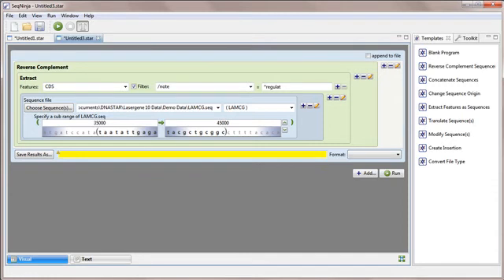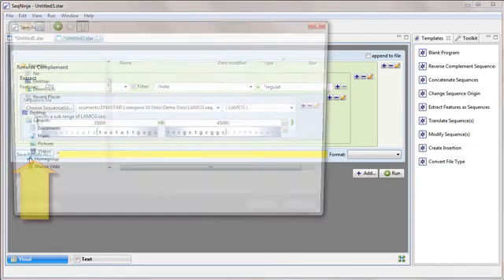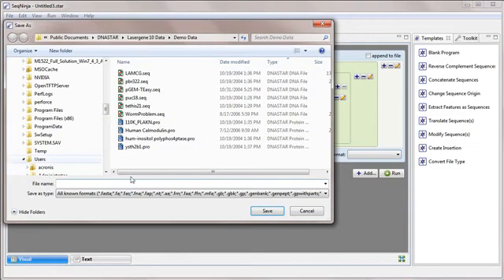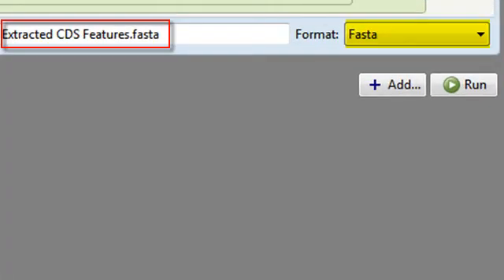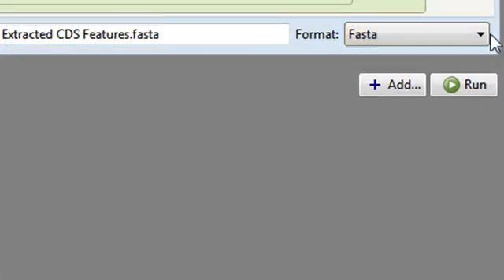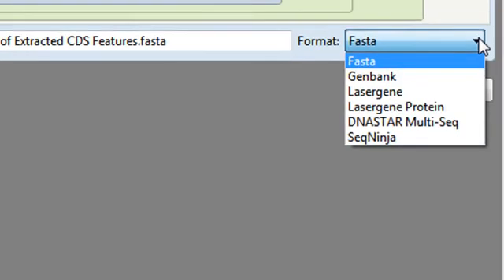Now I need to choose a place to save the output file. To do this, I click the Save Results As button. By default, SeqNinja assigns this to the FASTA format, however, I can use the Format drop-down menu to choose from among several other alternatives.